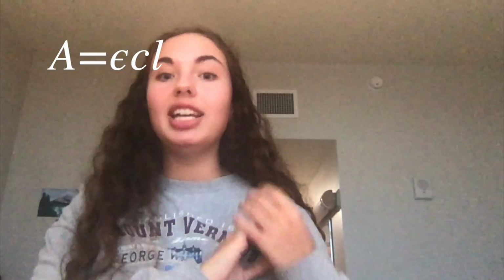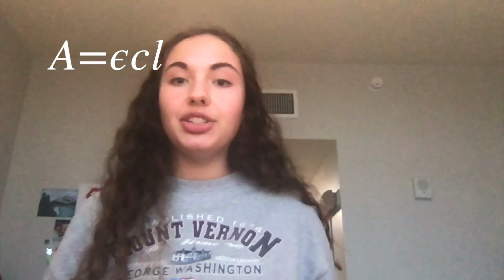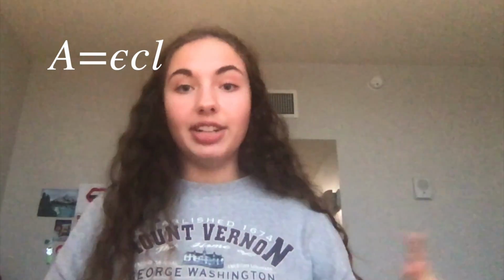So in this lab, we use Beer-Lambert's law in order to find the concentration of an unknown solution given absorbance values. This equation is absorbance equals molar absorption coefficient times concentration times optical path length. Generally, in this equation, the optical path length would be 1 and the molar absorption coefficient would be equal to the slope of your graph. Based on the equation, absorbance and concentration have a directly proportional relationship. So, if one goes up, then the other one must go up as well, and vice versa. So, the equation of your graph should be a linear equation.